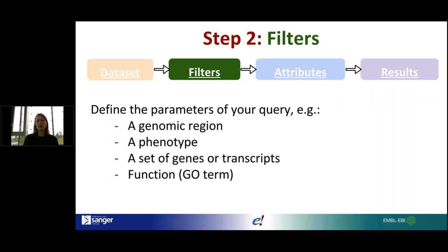Filters are the parameters of your query — you apply them to your dataset so you're not searching the entire Ensembl database. For example, instead of searching genes on every chromosome, you might filter to genes associated with a specific genomic region, or only a portion of a chromosome. You might also filter by phenotype, by a list of genes or transcripts, or by a particular gene ontology term.